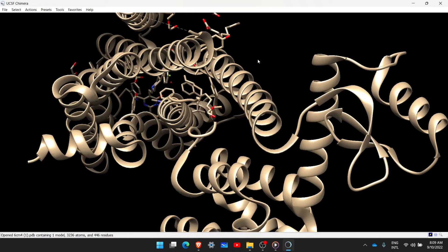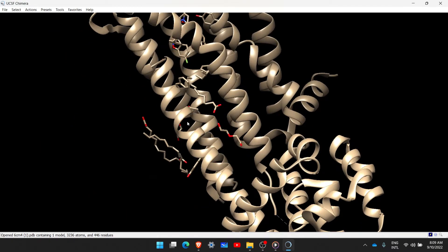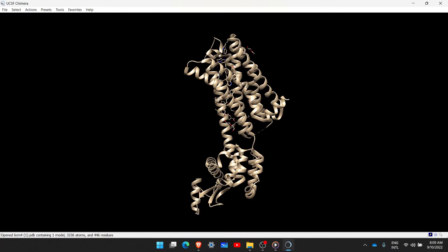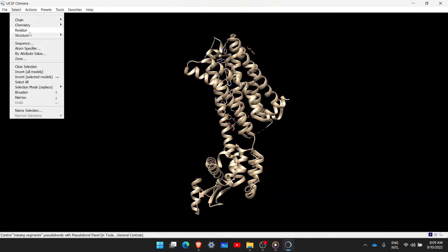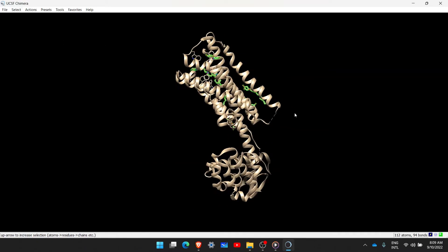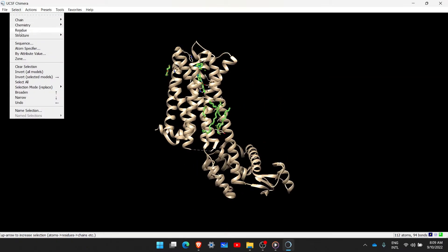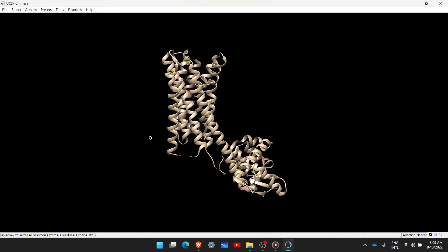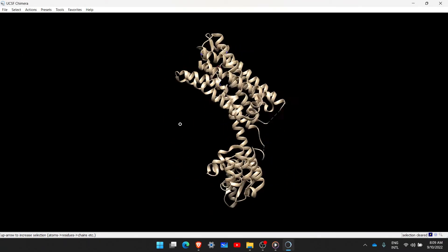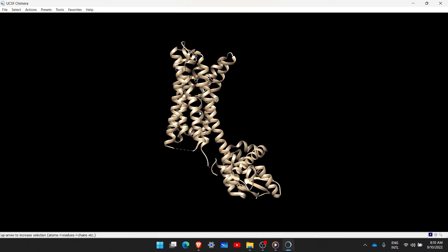This is the protein we are dealing with. We don't want any ligands here, so we will remove them all. I clicked on all non-standard ligands in this protein, went to Select, then Actions > Atoms and Bonds, and deleted them. We have now completely removed all the ligands.